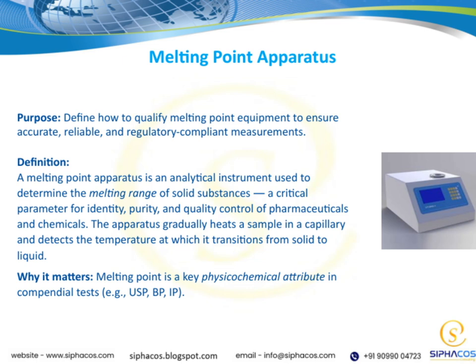The apparatus gradually heats a small sample placed in a capillary tube and detects the temperature at which the sample transitions from solid to liquid. This melting point is a key parameter in many analytical and quality assurance processes.